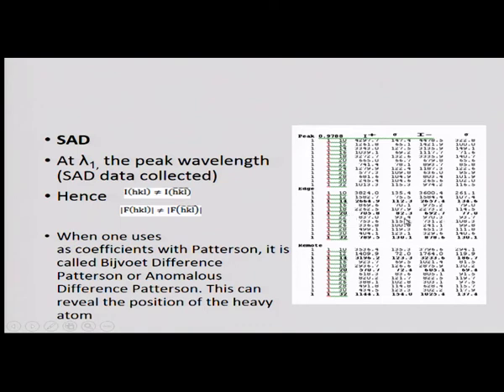When you merge it, roughly I am getting around 700, let us say 1120, I am getting roughly merging 700. Same 1120 go here. This is 570 plus reflection minus reflection 605. Again, if you average, we get maybe 580, right. Now, between these two wavelengths, remote and edge, I am just giving only one example for a particular reflection. 1120 at the edge or inflection has roughly 700, whereas here it has 600.